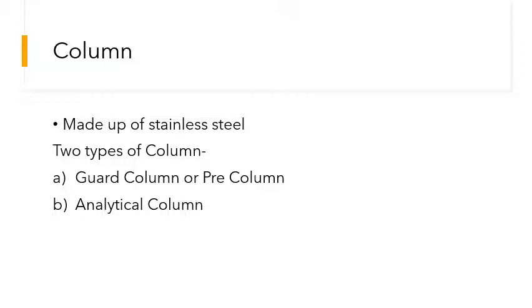It is about 2 to 10 centimeters in size, and the large size column is the analytical column. The separation of the components from the sample takes place in the analytical column. The guard column is used before the main column.